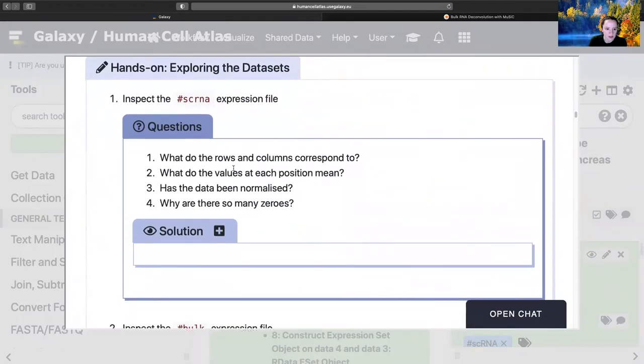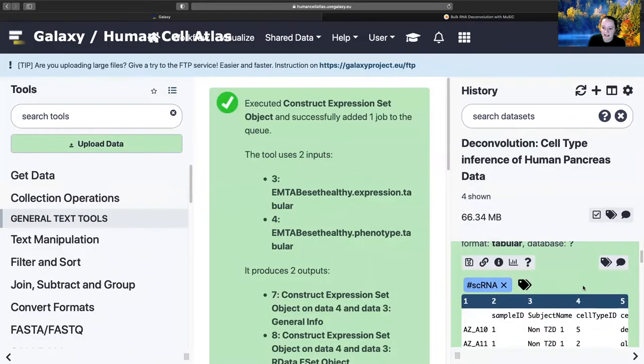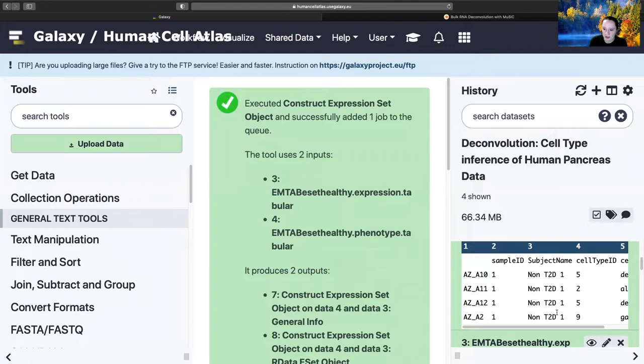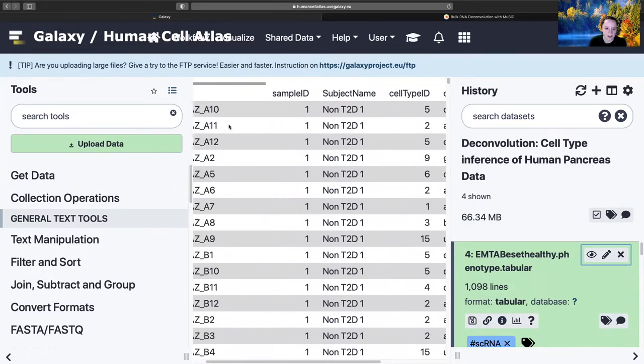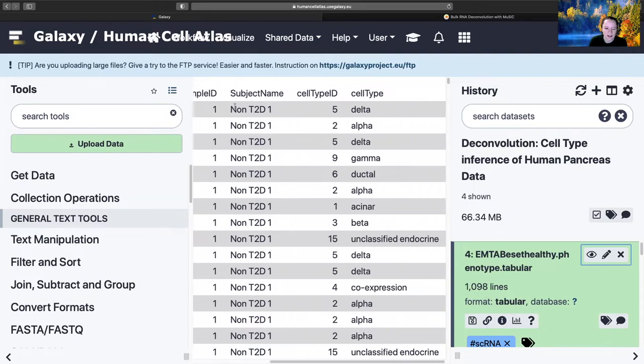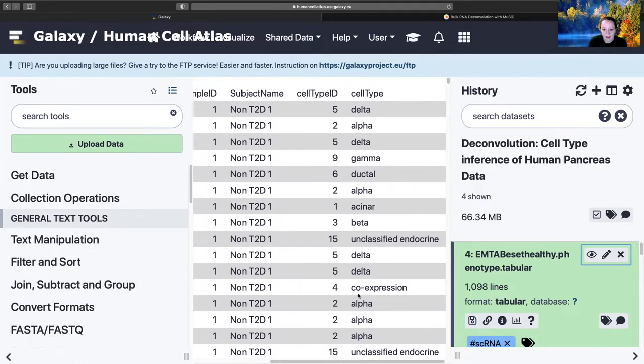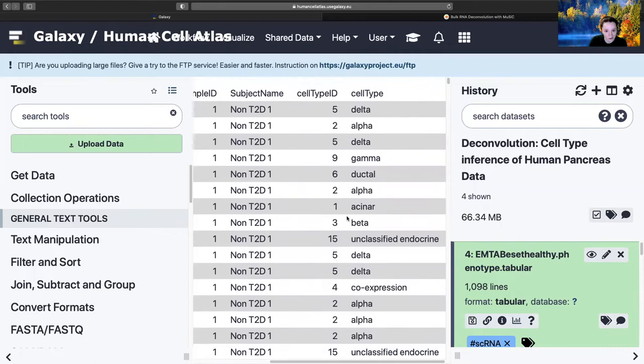We've got some important information about the datasets, so we can now investigate them. You can look in a little window here, or you can view the data. This is the phenotype for the single cell RNA data. You have the cell ID, and then it tells you the subject - these are non type two diabetes. Then you have all of the different cell types. I appreciate their unclassified endocrine. I appreciate the honesty when they're annotating their cells, because sometimes you just don't know.